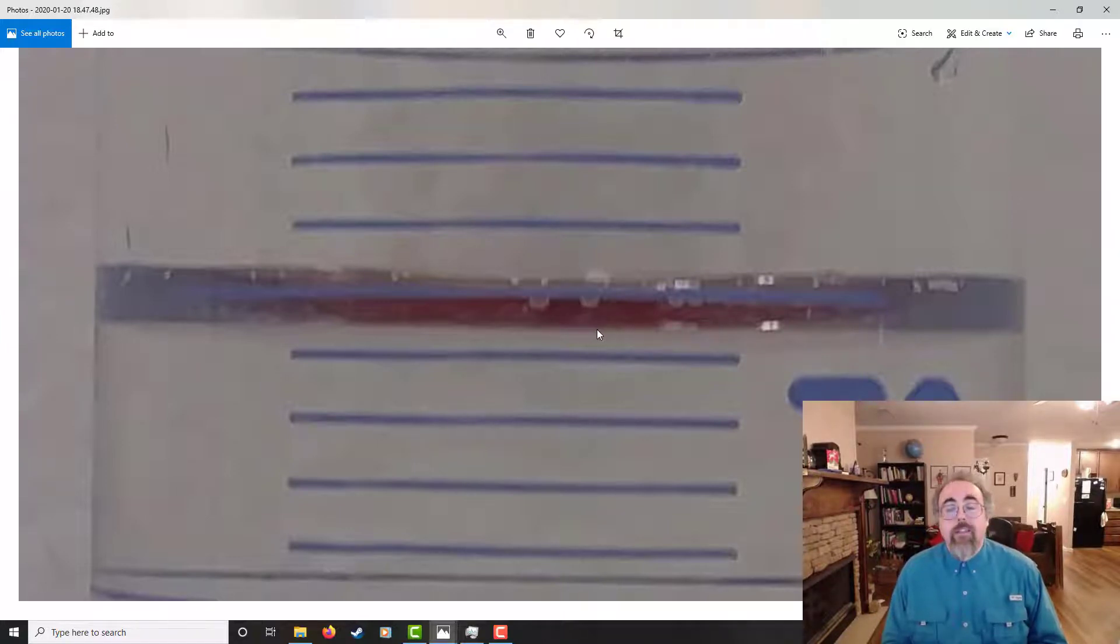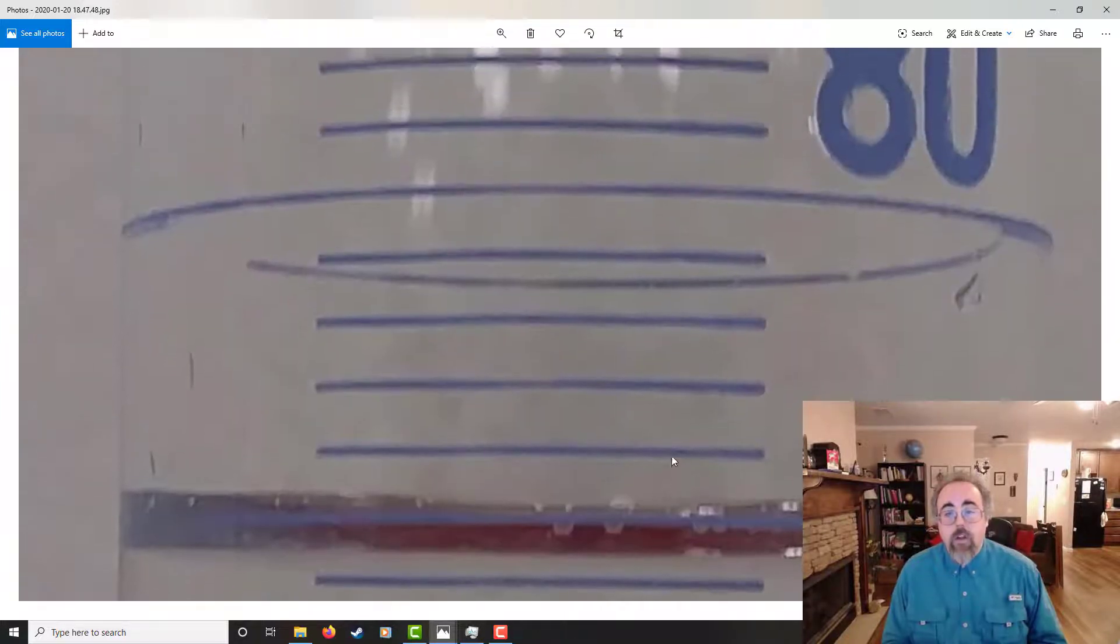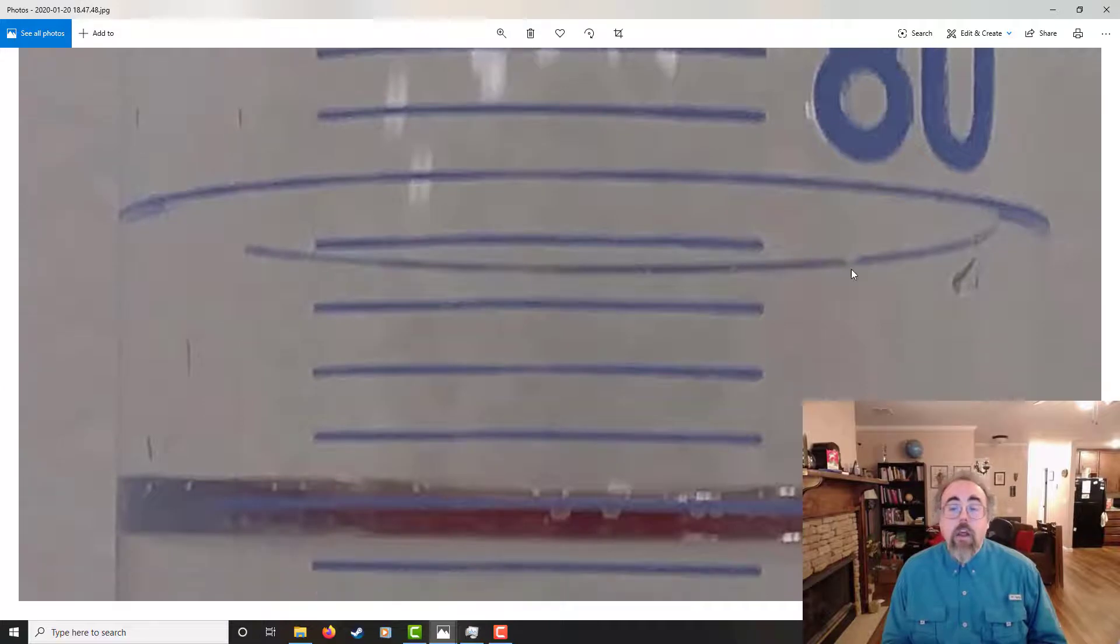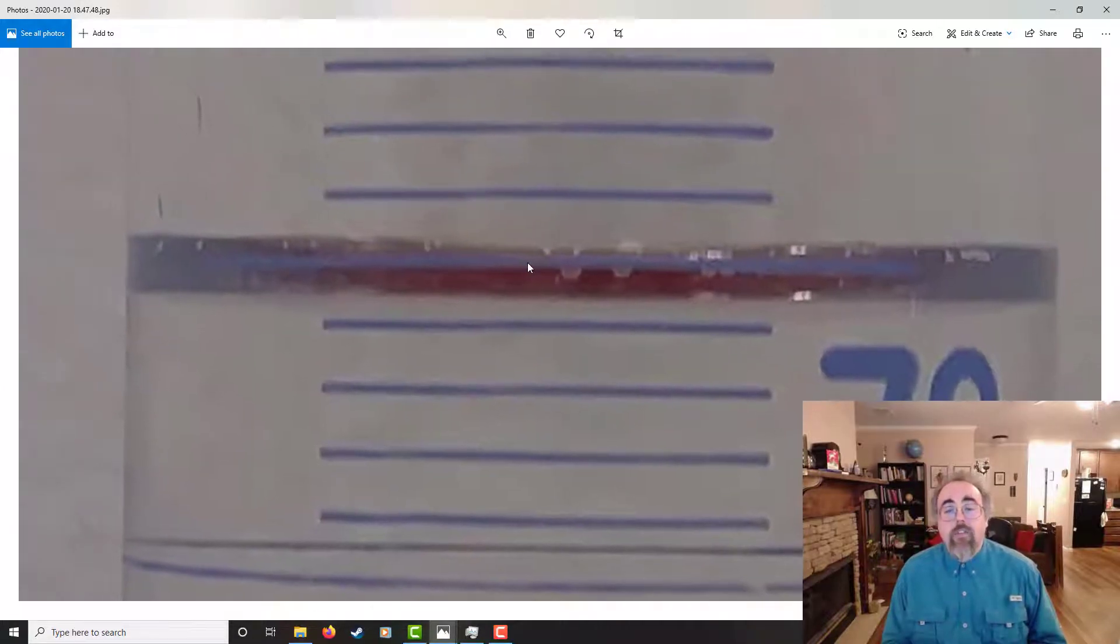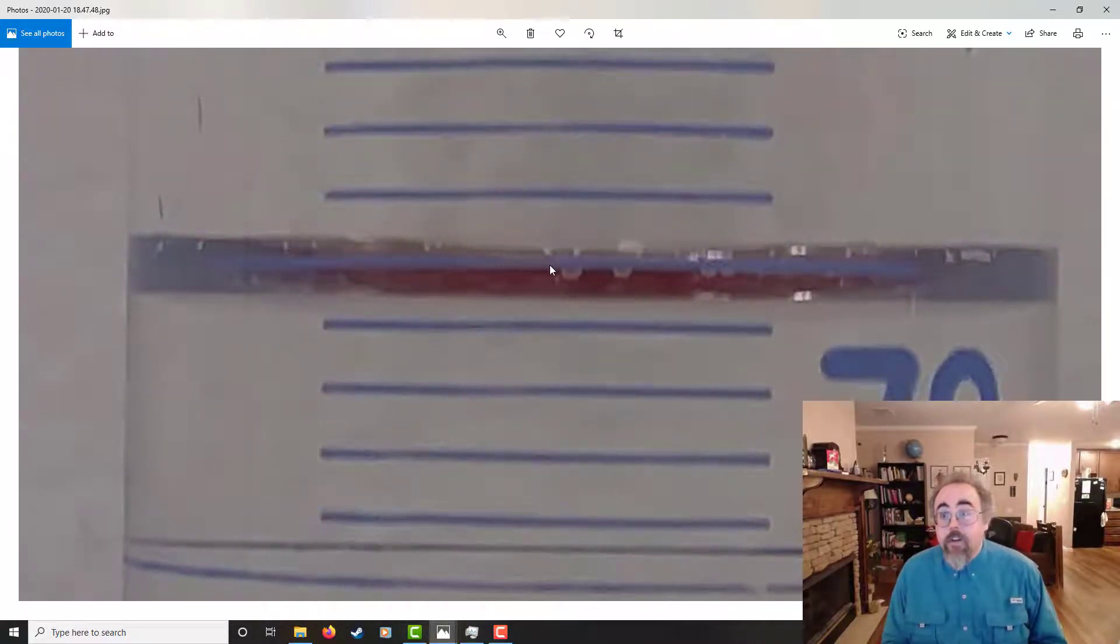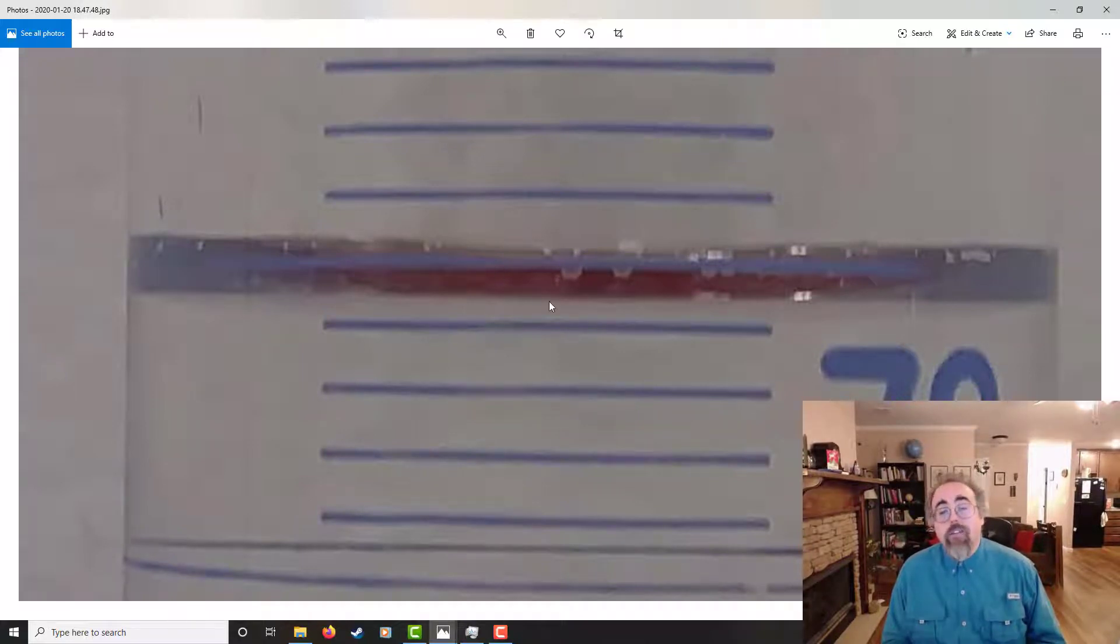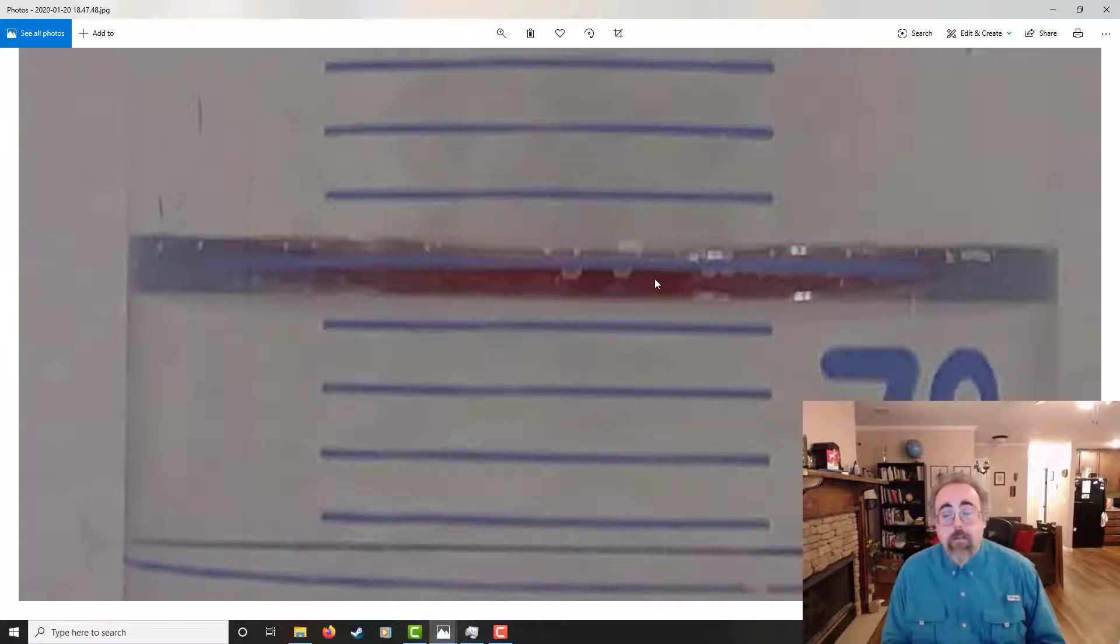So that means that this line up here is at, one, two, three, four, five, six, seven, eight, nine, ten. Okay, that'd be 75. This line here is 75 milliliters if the bottom of the meniscus is right on that line. You'll notice it's not. So this is 74, that's 75. I count the meniscus, I count the lines, I can tell pretty straightforward.